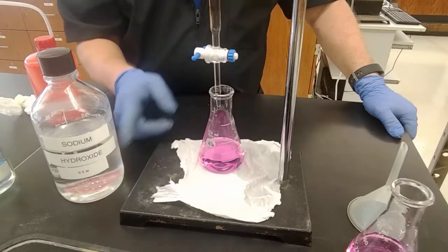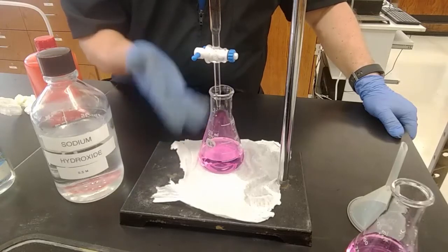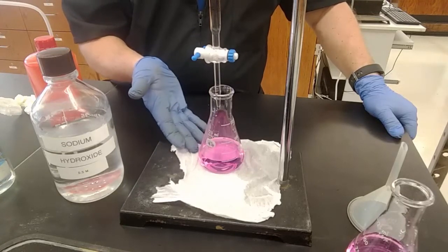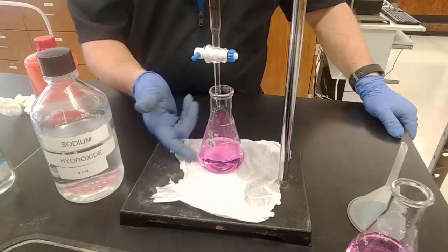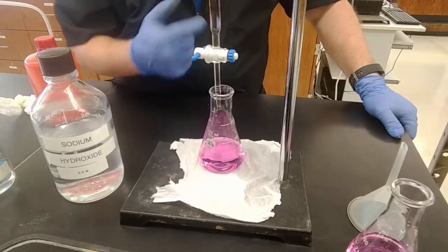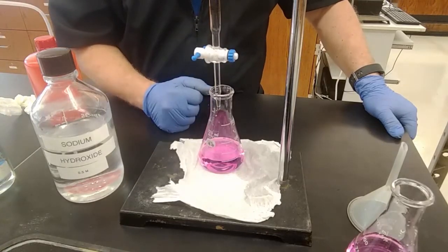And since the number of moles of base is exactly the same as the number of moles of acid, we're assuming, when it's all finished reacting, then if I add too much base, it's as if I had more acid to start with. And that's going to give me a higher percentage of acid in the vinegar. So again, ways of explaining any error.